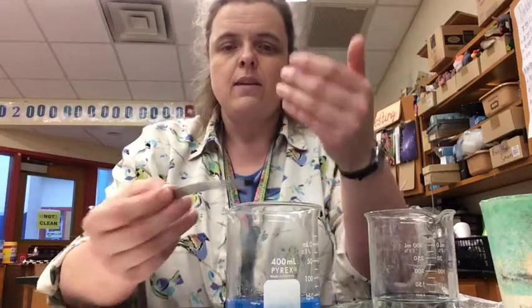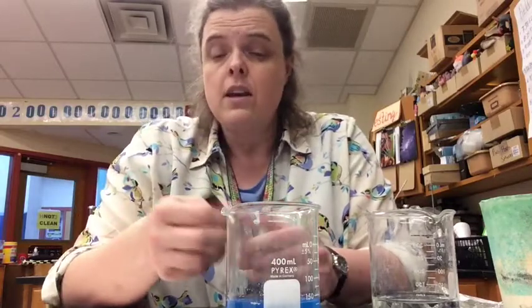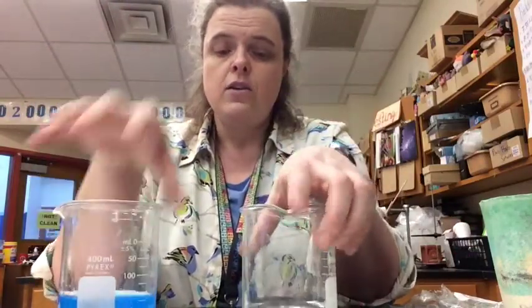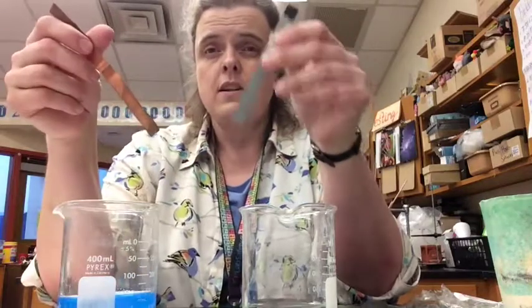Is there a way that we could use that energy? Electrons moving, that's electricity. Is there a way that we could actually capture that? And it turns out there is. In order to do that, you're going to make an electrochemical cell, and this is what we're going to talk about this week. You need 2 solutions. So I've got my zinc ions, my copper ions. You need 2 electrodes, zinc and copper.